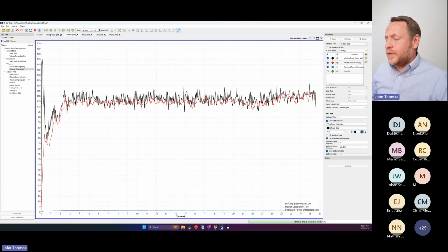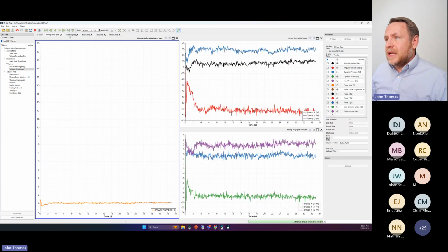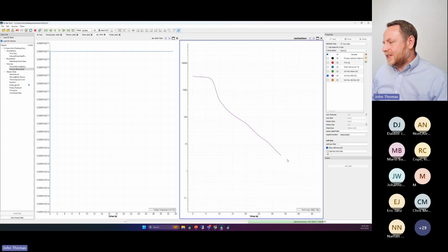So there we go. They're looking good. If we ran this at double the resolution, we'd get the same results in terms of power number, EDR, etc. And kLa and blend time too, because it all hangs on EDR. This guy's ready to blend. He's at like 97%. We're getting about 20, 30 seconds or so, depending on when we started it. That's in line with the measured data.